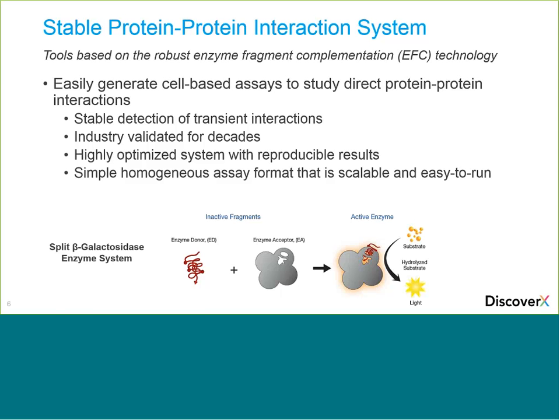And then finally, for the assay part, you're going to need detection reagents. This is the substrate reagent I mentioned in the last slide. Then you'll provide your ligands to do your screening and obtain your pharmacological data within minutes to several hours. So I'm going to have a slide for each of these tools, and then we'll move right into the protocol.